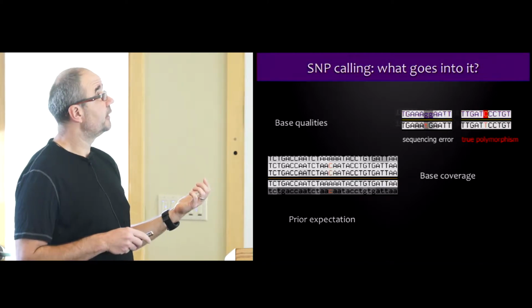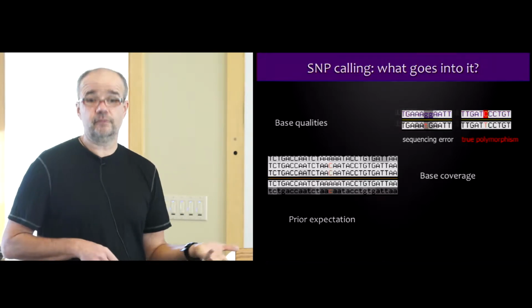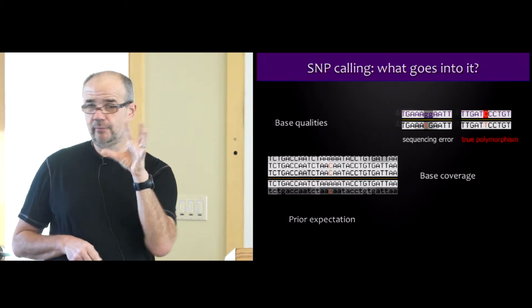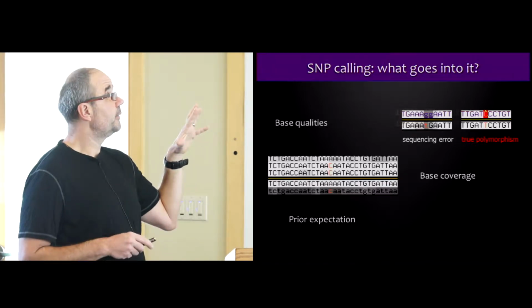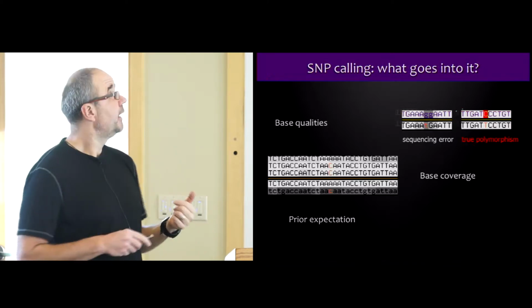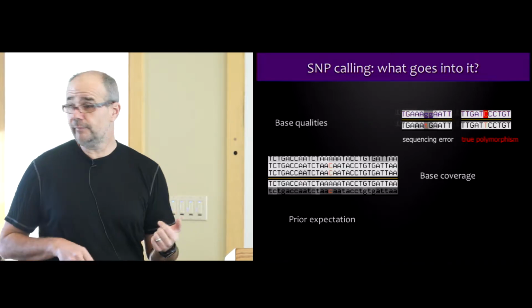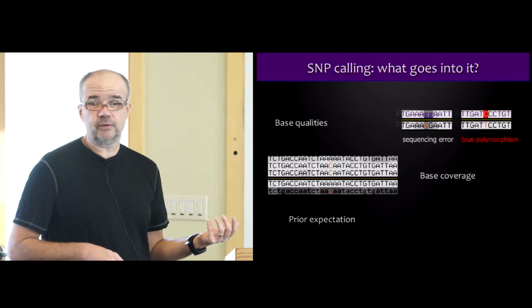So in this particular scheme, capital letters mean very confident nucleotides, and the whiter the background, the more confident it is. In this case, we have a very confident C against a very confident T. In this case, we have a low quality, not very accurately measured G versus a not very accurately measured T. Which one do you think is more likely to be a real polymorphism?